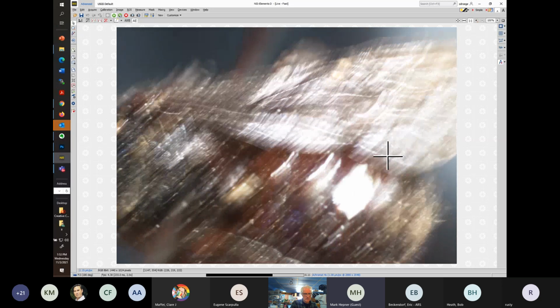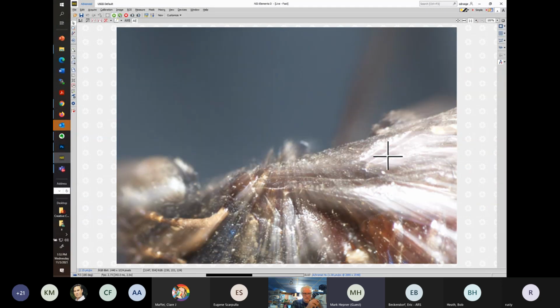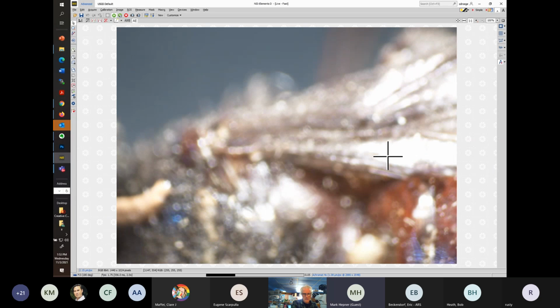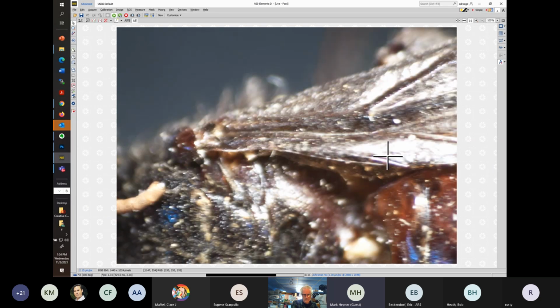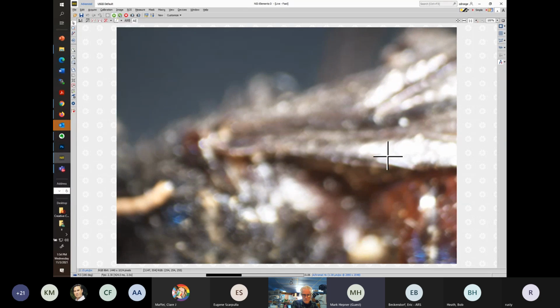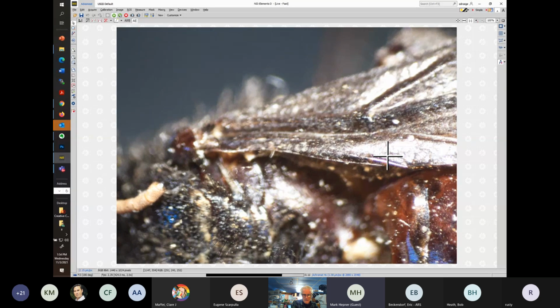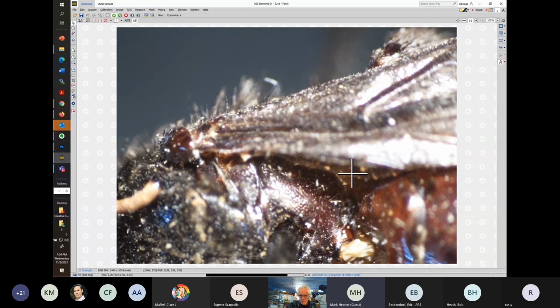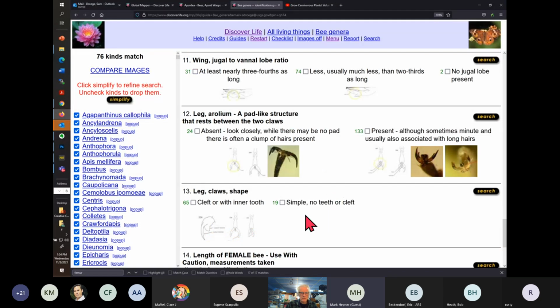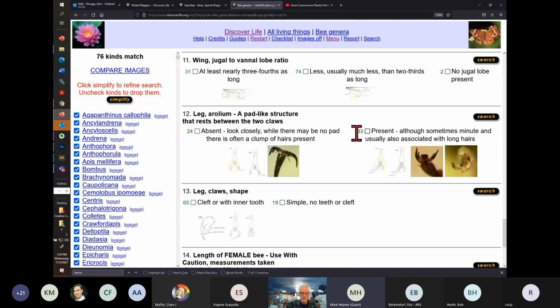The dirt is pretty atrocious. I don't want to spend too much time, but I believe this is one of the lobes. Let's just see what happens here, and we'll pretend like we have looked at it quite well.